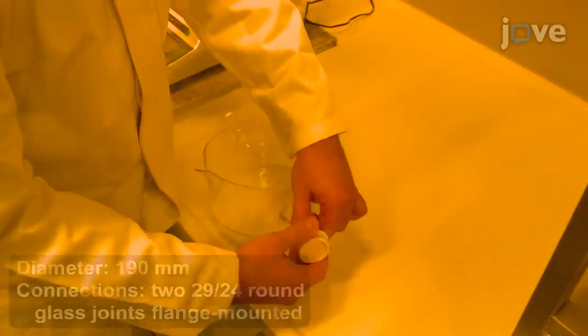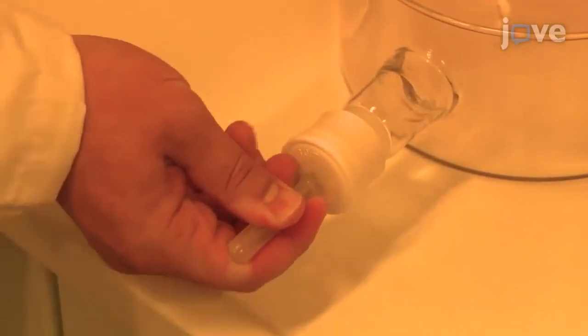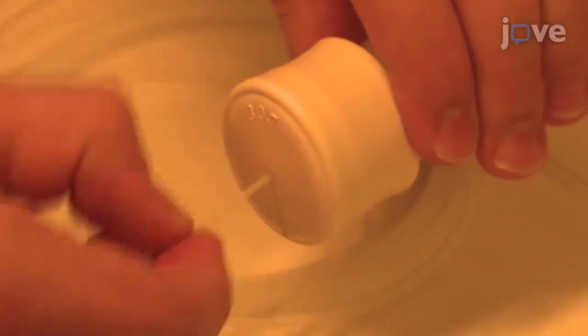First, equip a glass water bath dish with two septa. Then, pierce the septa with an awl to create a hole to position a tube with an outer diameter of 1/16th inches.